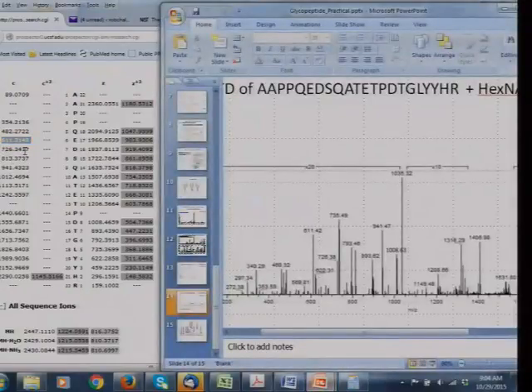Do we see a 726? We do. An 813. It hasn't labelled it. I wonder whether that's 813 or not. We see a 941 though. The next one will be 941. So I bet you that's 813 and the software hasn't labelled it.